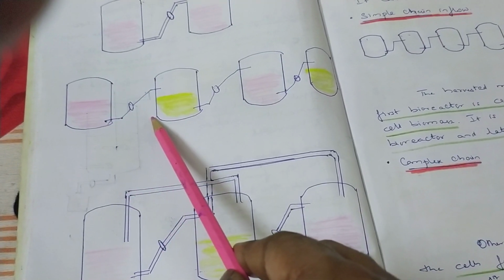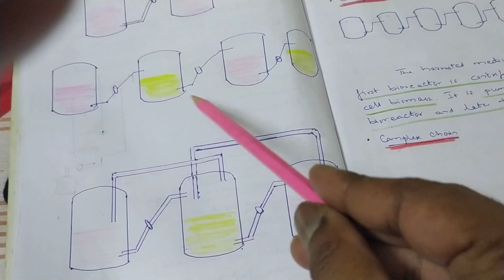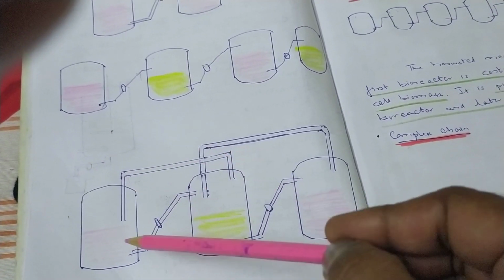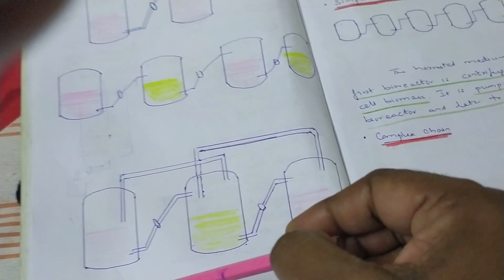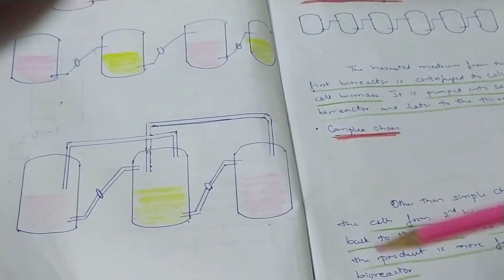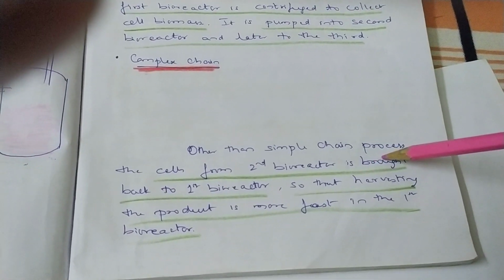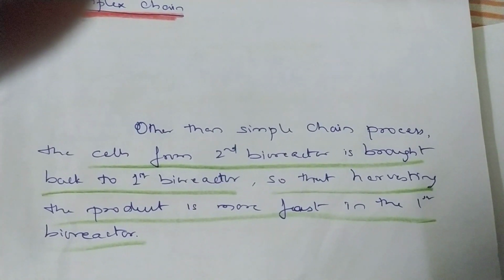But the same thing if you make it complex, imagine the same thing, second day, 4th day. So let's say your 6th day is a final harvest here. If you do this complex chain, the cells would have come from here also back, so that the fermentation will go faster. Maximum utilization of nutrients happens. Harvesting can become the 3rd day also or 4th day also. So the time of harvest is reduced for the whole process. This continues in a similar way. This is called complex chain. Okay, so please remember, it is different from simple chain. Cells from the second bioreactor are brought back to the first bioreactor, so that harvesting the product is faster in the first bioreactor.